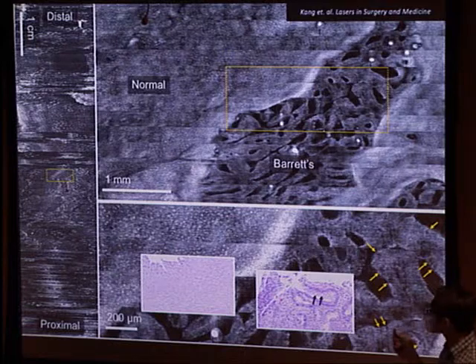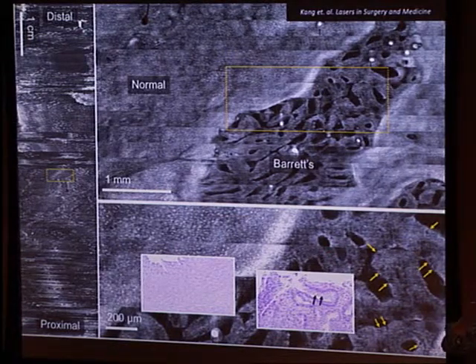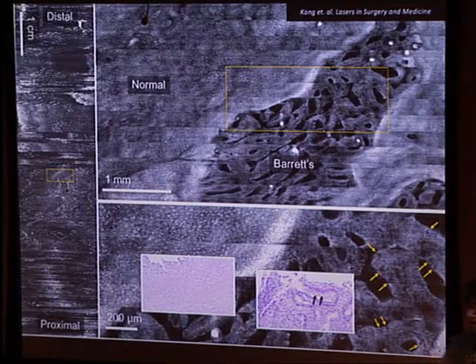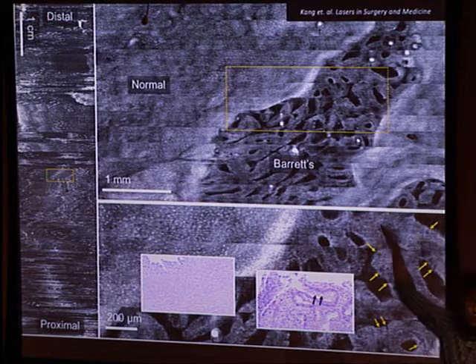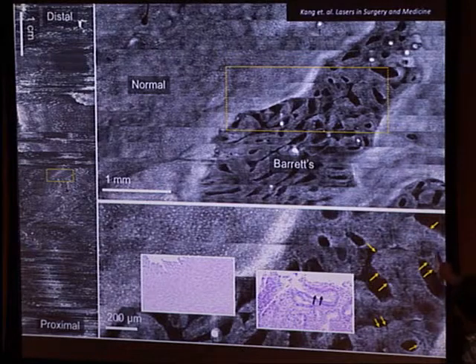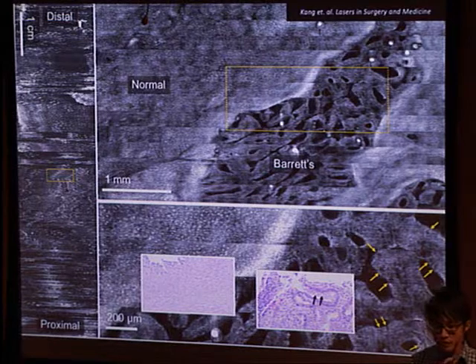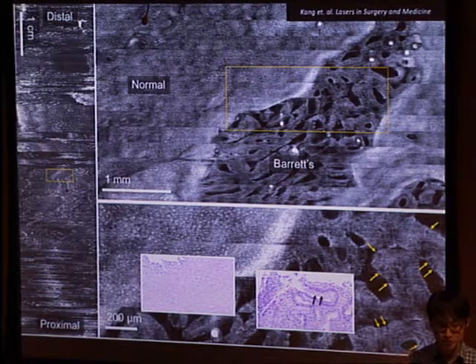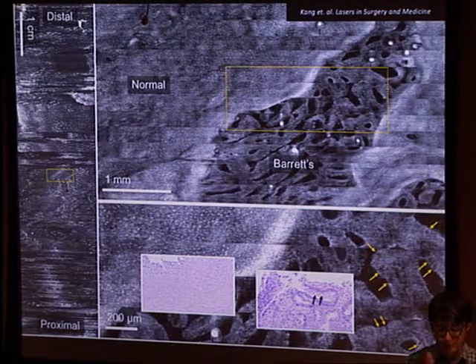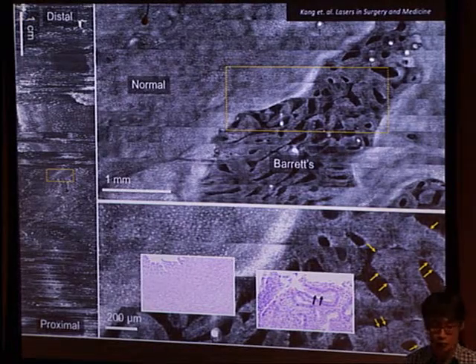Right. So what you're seeing as one strip here is one field of view given by the objective lens. So that's about 280 microns. It's not like we are covering the whole 7.5 centimeter with one dispersion. So the top of that strip might be imaged with red, and the bottom of the strip blue. But red and blue are just purely a conceptual visualization. The actual wavelength used was centered at 1300 nanometer, with plus or minus 50 nanometer bandwidth. So it was all near infrared light.